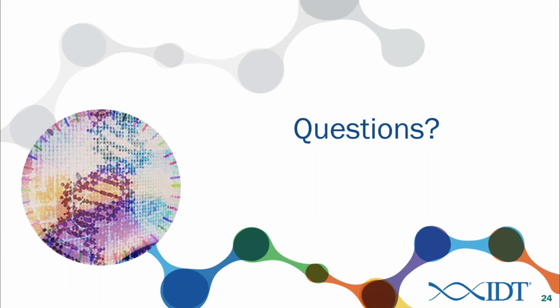The other thing I'll mention with that, it may be slightly less, and sometimes quite a bit less accurate, but it is still very accurate to use a single target, a single guide RNA, and that seems to be able to get the job done and get the job done a lot quicker. So that's what most people are using, and that's what I would suggest to use.